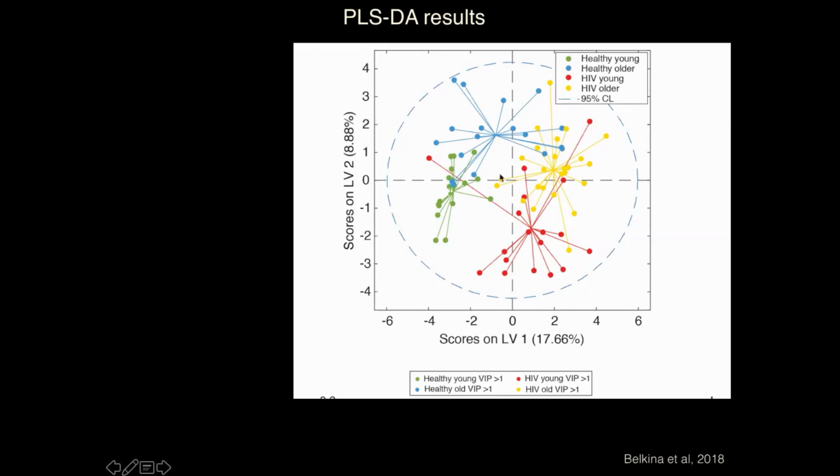And all 4 groups separated pretty well, as you can see, and also as you can quantify, they're significantly separated. And a reasonable question that we asked ourselves before the reviewers would ask it was: what if the plasma data alone would do this separation?